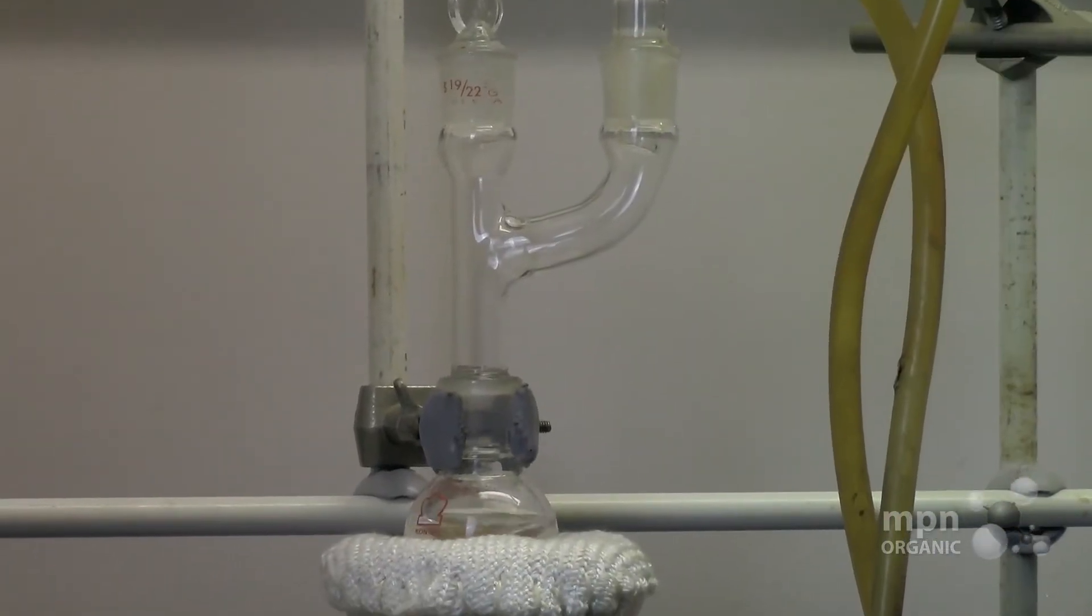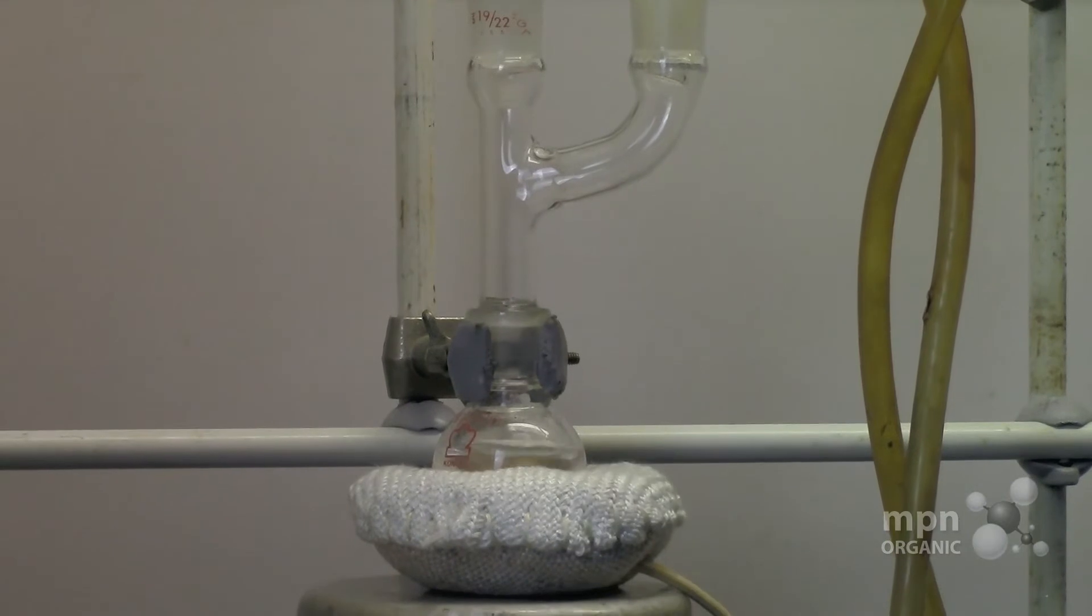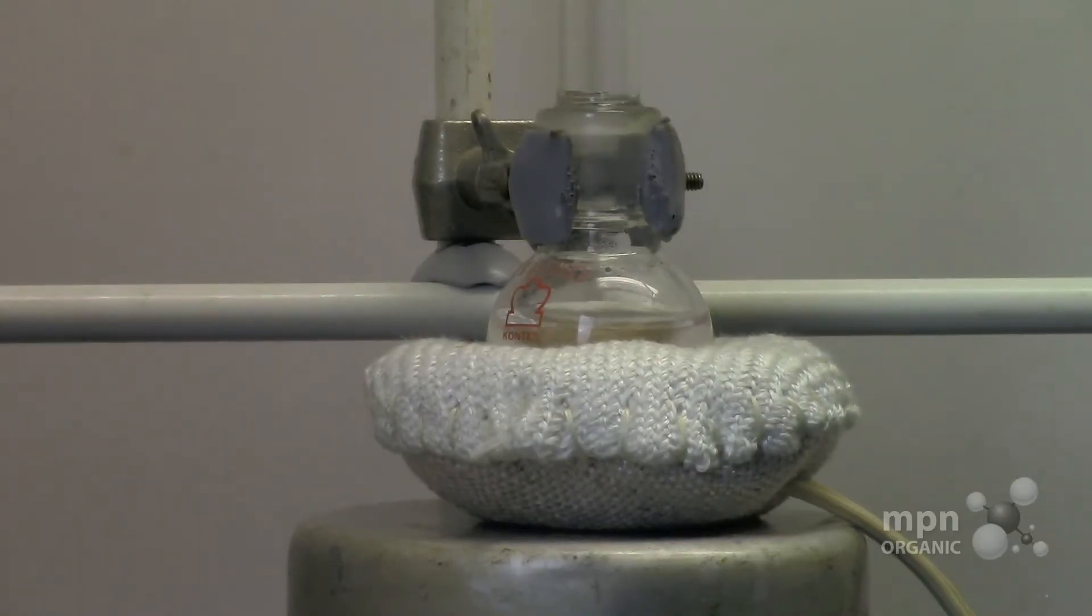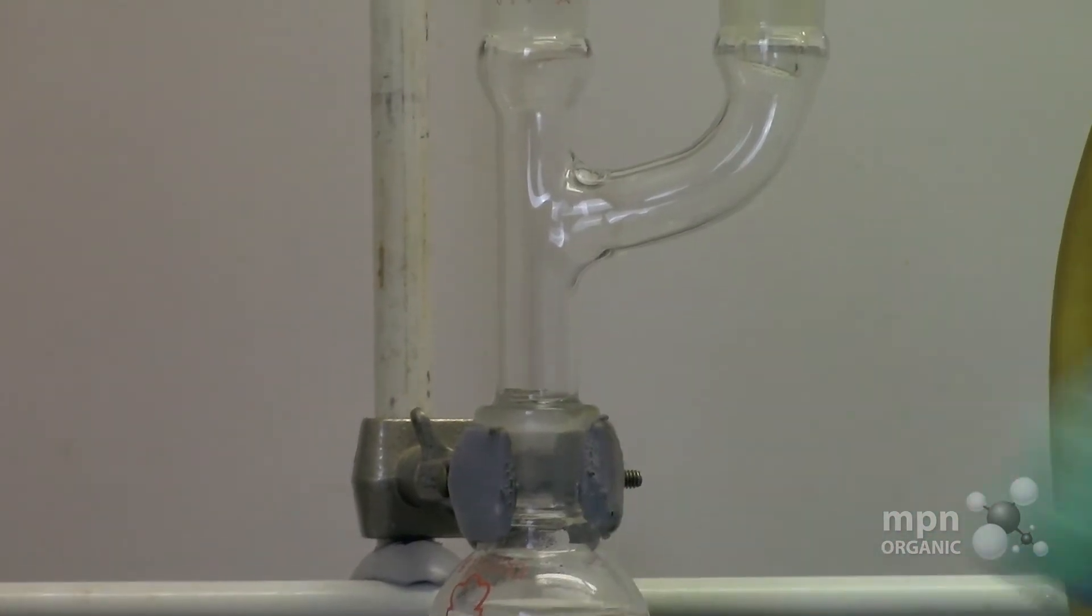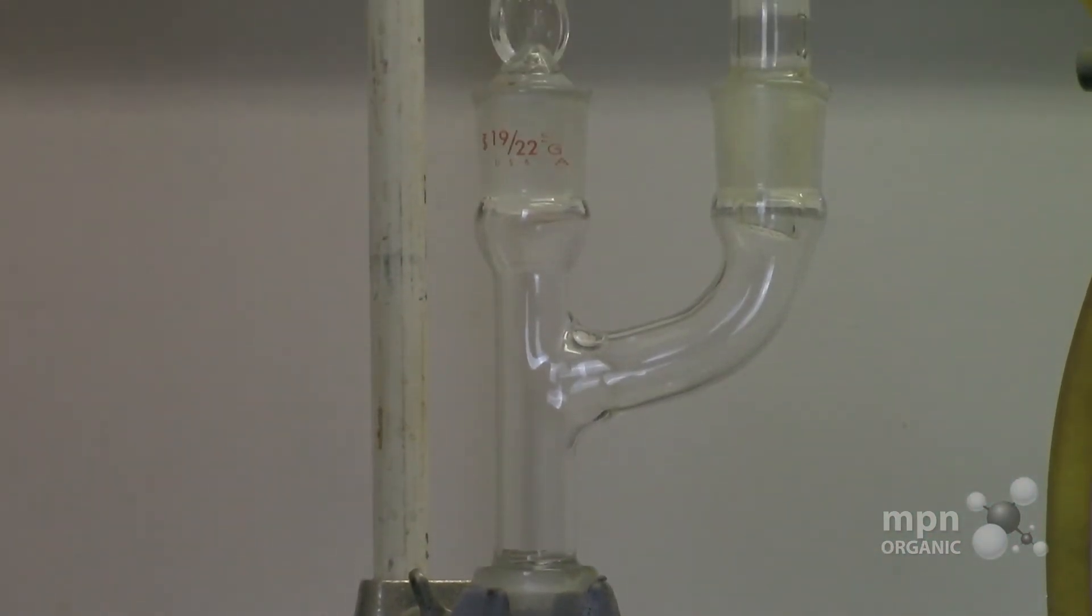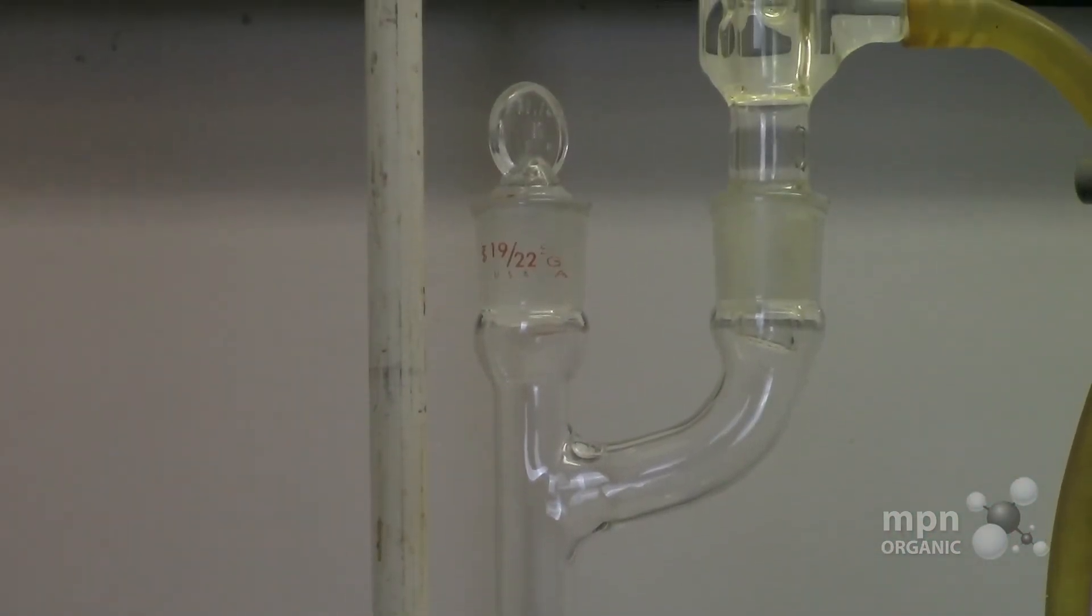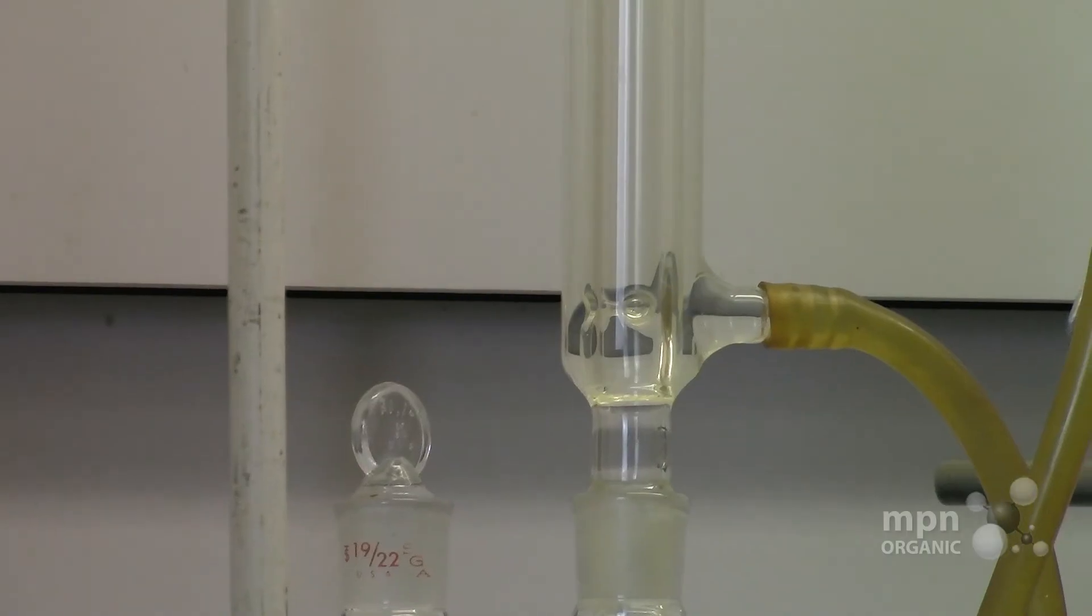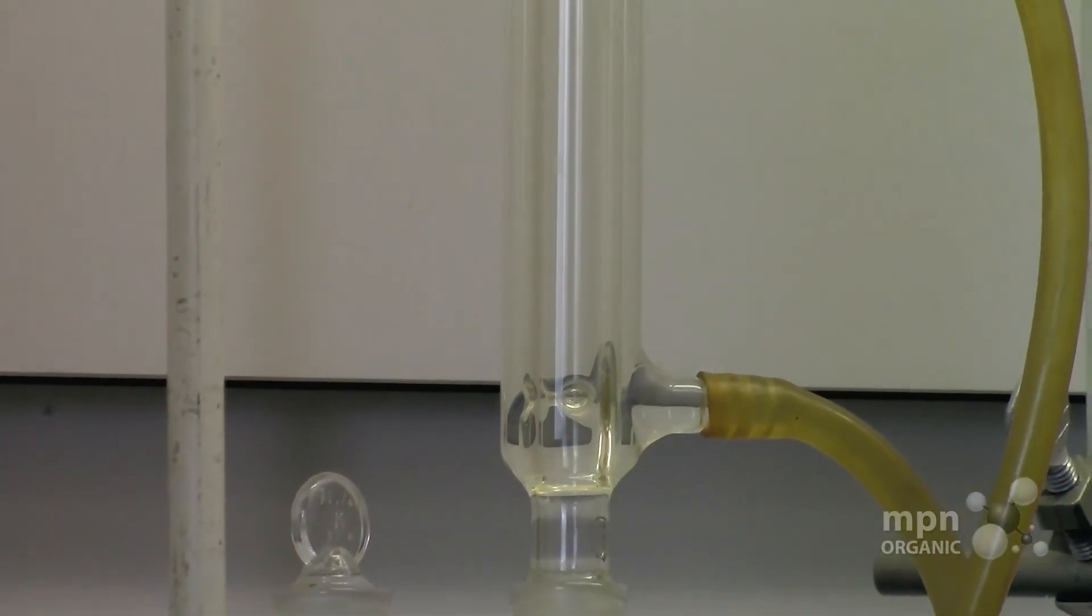And notice I don't have to use the Keck clamps when gravity is holding this thing all together. It's in a distillation that I have to be very careful that this will not separate from the main body of the round bottom that's over there. Okay, and that's how you can use the Claisen adapter as a piece of equipment for the reflux.